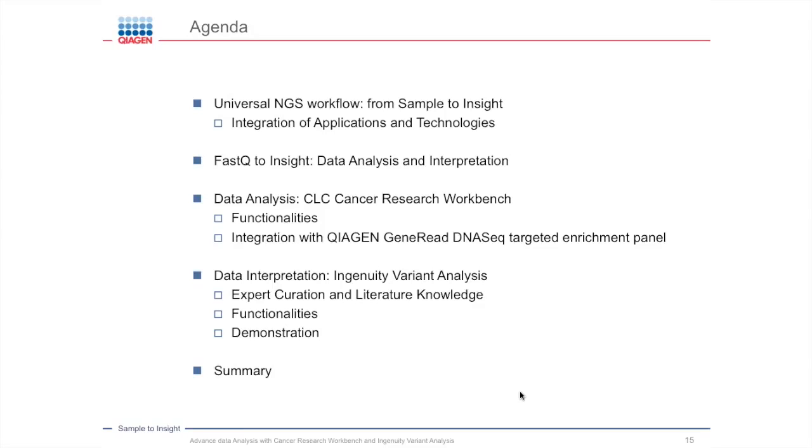It also allows you to do visualization and validation of your results. You can look, for example, at the pile up and see all the different reads that you have within the CLC Cancer Workbench. It's flexible. You can customize both the data analysis and the interpretation, and it's extensible. So you can also add more and more samples as you go through it. And it's scalable from one sample to multi-sample analysis.